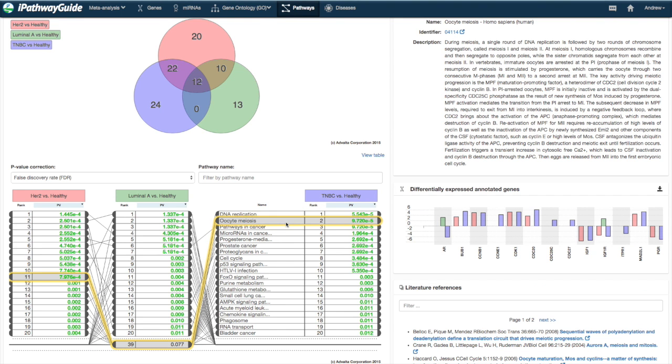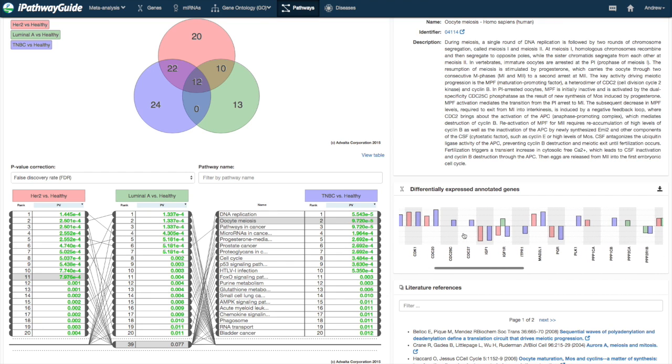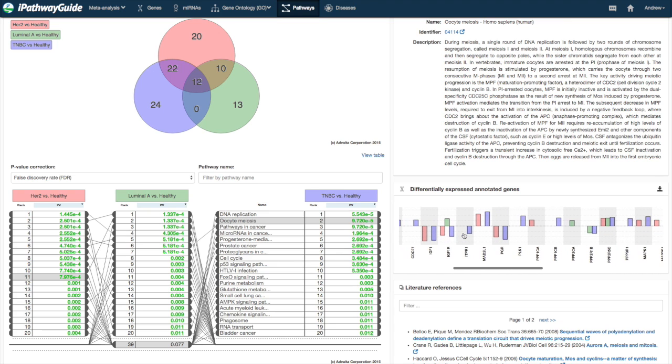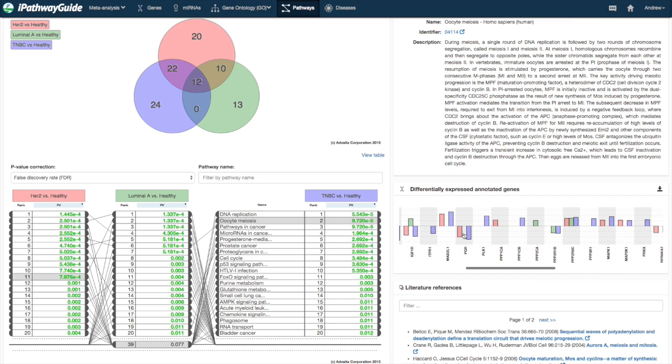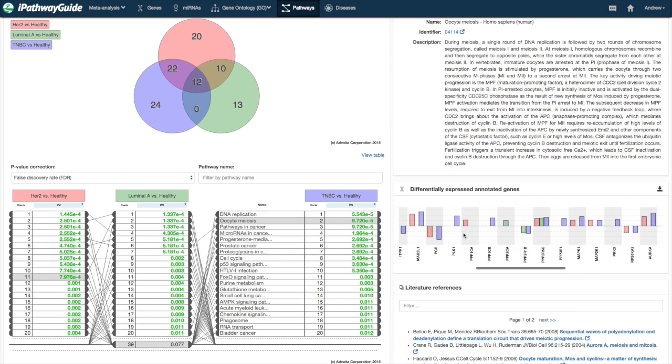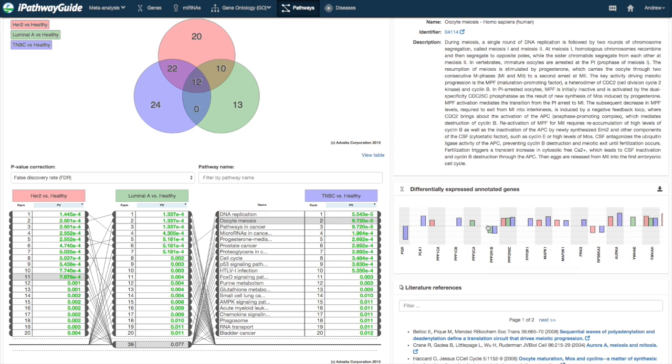The differential expression plot shows the gene expression values for the selected entity for each contrast where at least one gene was significant in terms of fold change and p-value. If there is no bar for a particular contrast, then that gene was not significant in that contrast.